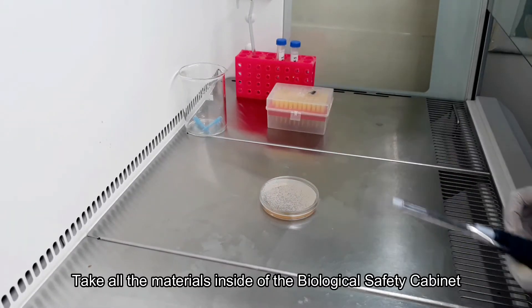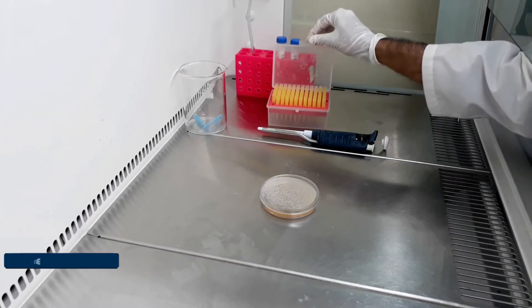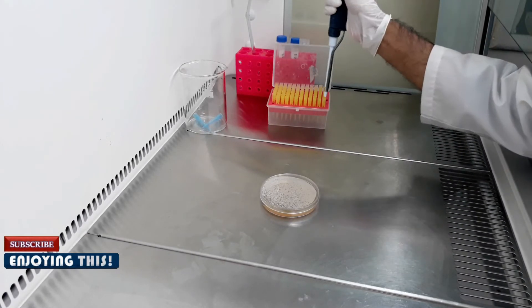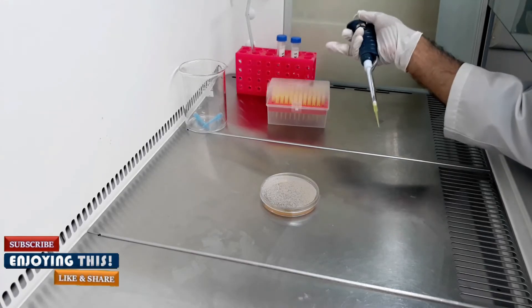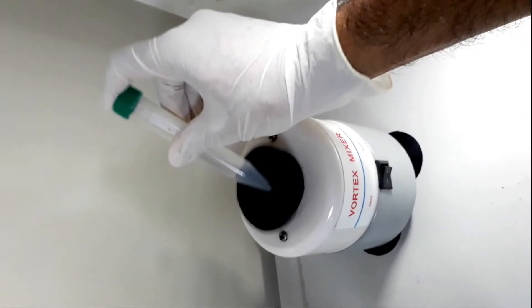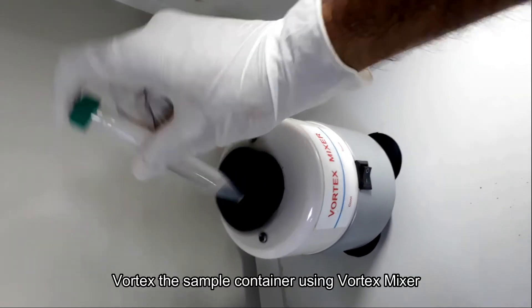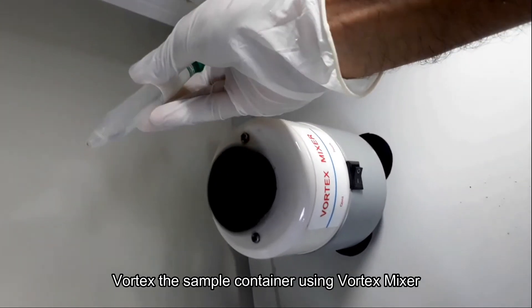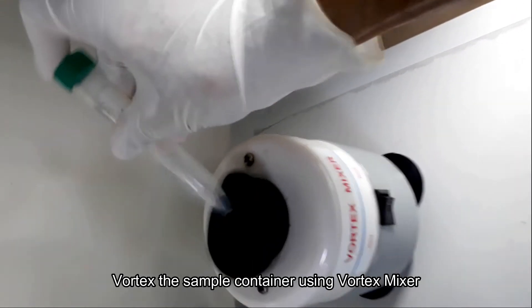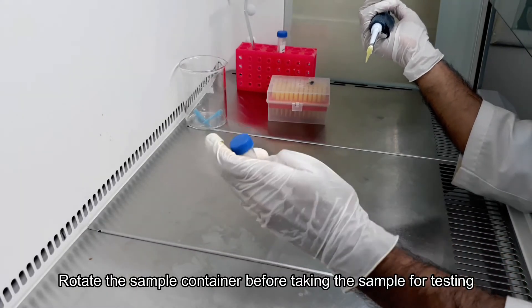Bring everything needed for the spread plate technique. Take sample one and vortex it to make a homogeneous mixture. Shake and invert the sample several times before taking it for testing.